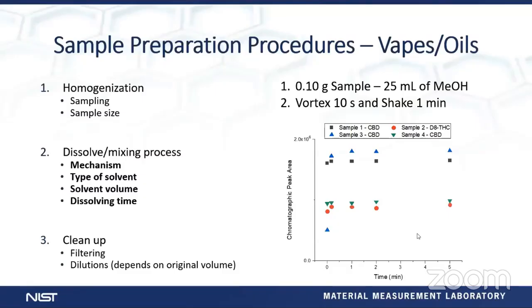I'm showing you the data here for some of those results. And what you saw is that pretty much right away after the 10 seconds, it was pretty much even across the board that it had been dissolved and dispersed throughout the methanol completely. And we ended up choosing the 1 minute shaking time as the appropriate amount of shaking for the samples.